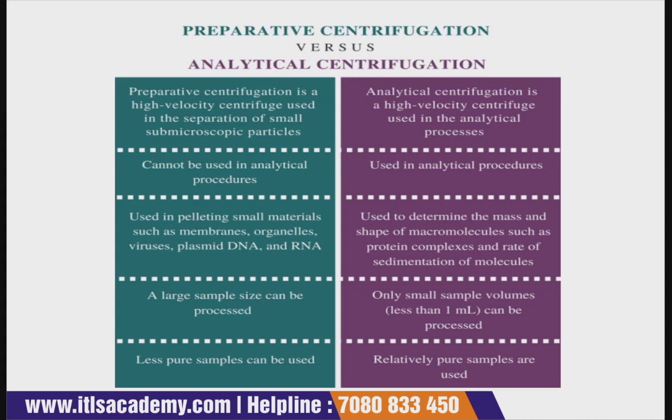The preparative cannot be used in analytical processes, while this type of centrifugation is used in analytical procedures. Then preparative is used in pelleting small particles. Which type of small particles? Like membrane organelles, viruses, plasmid DNA and RNA.